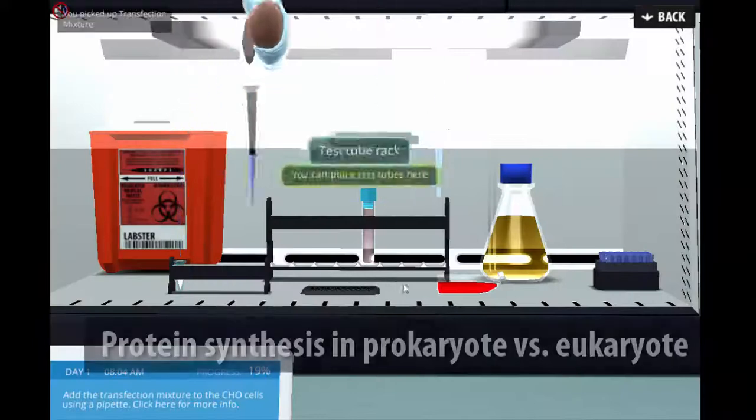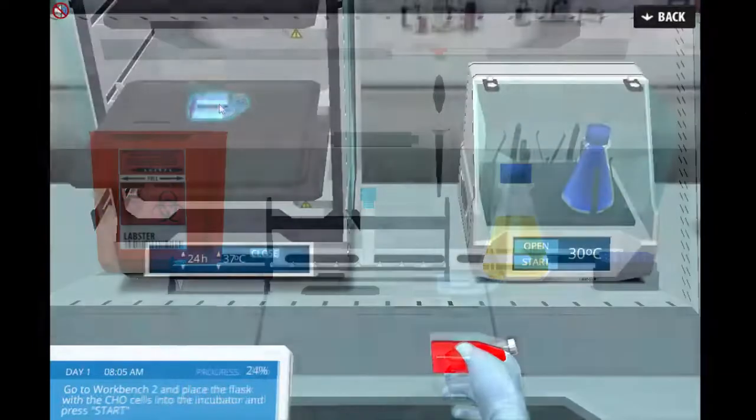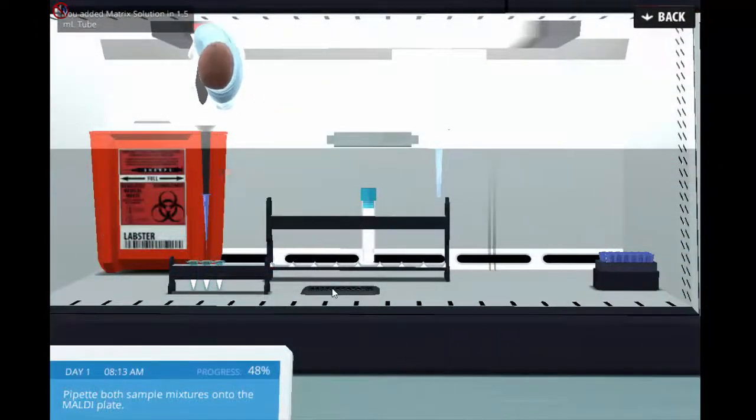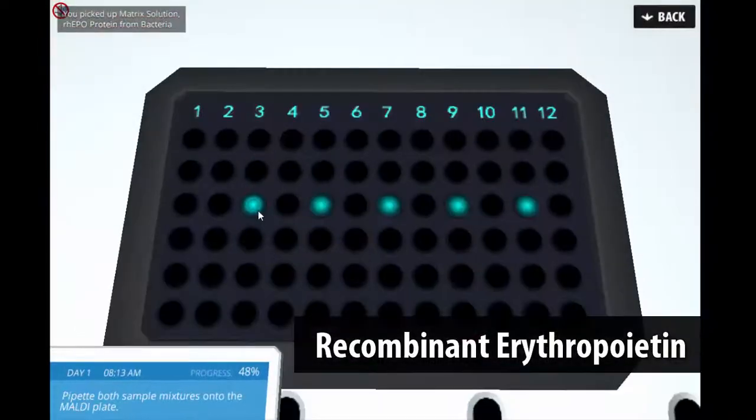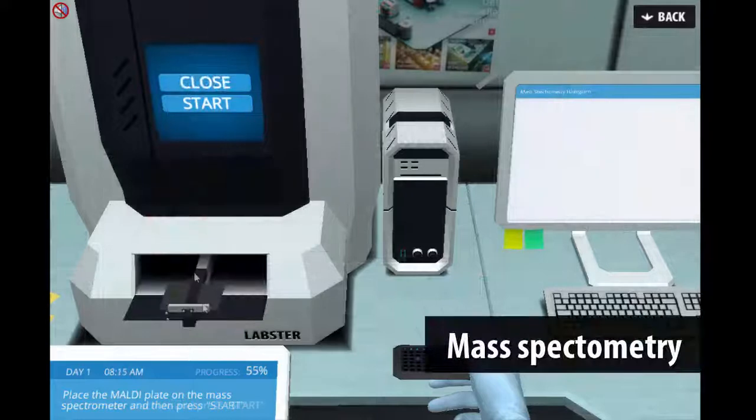The virtual lab starts by asking the students to prepare recombinant erythropoietin that is transfected into E. coli and CHO cells. The lab assistant will prepare the recombinant EPO, and students would be able to measure the mass-to-charge ratio using a mass spectrometer.